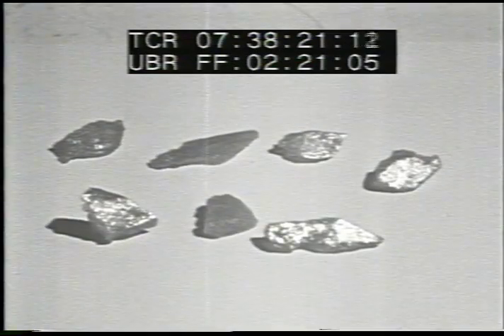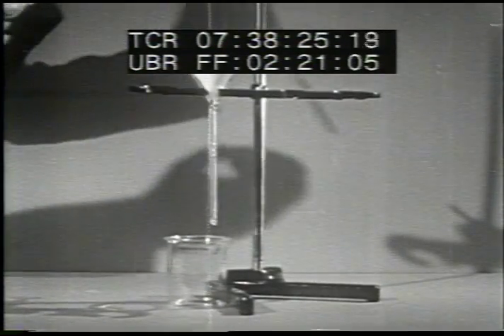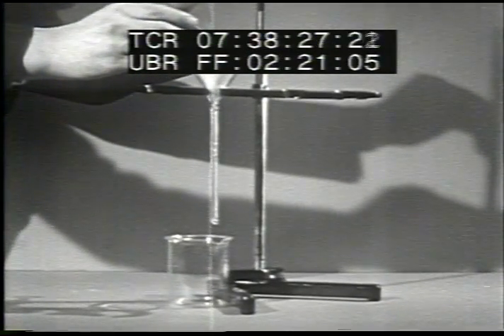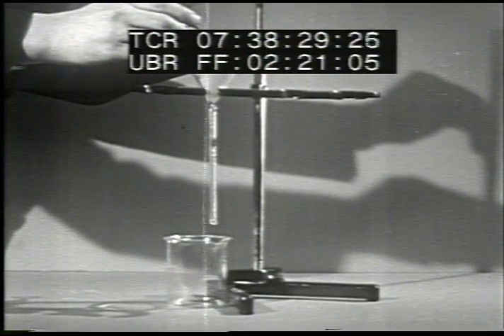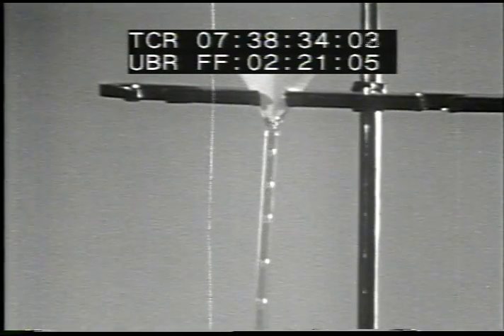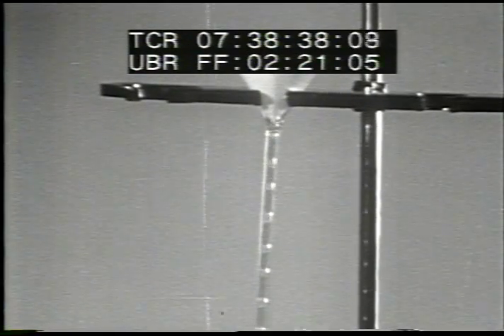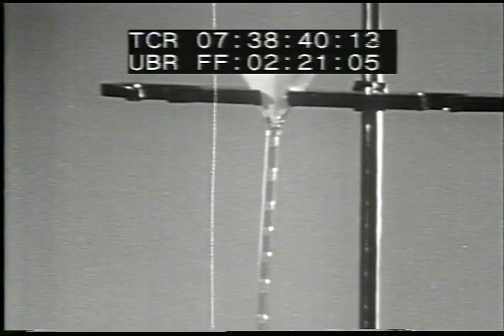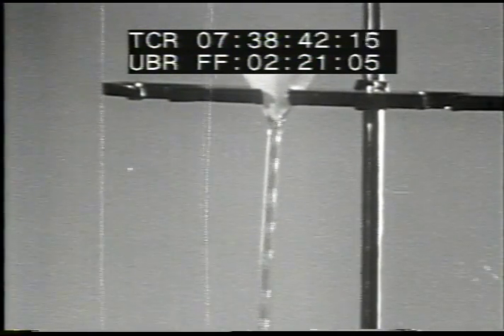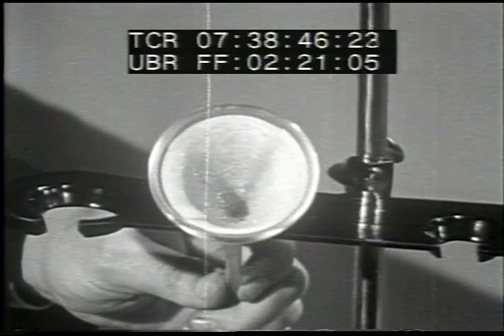The crystals have the definite shape of geometric figures. We may separate the crystals from the solution, called the mother liquor, by a filtering process. The contents of the dish are poured on a filter paper suspended within a funnel. The solution, which is still saturated with the solute, passes through the filter and is now called the filtrate. The crystals, known as the precipitate, are held on the filter paper.